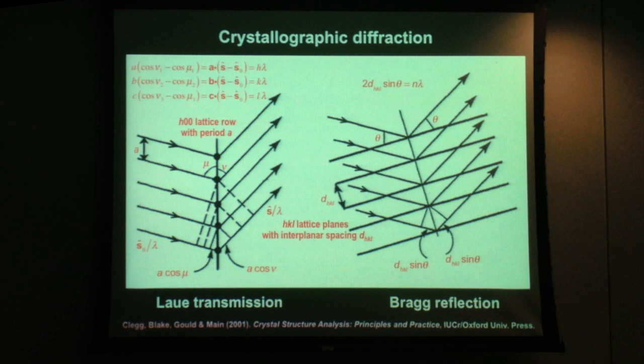We talked about the fact that Bragg realized that these very same X-ray diffraction effects could be interpreted as if they were specular reflections, mirror-like reflections, equal angles of incidence and scattering off the families of parallel lattice planes. And remember, clearly we are here talking about just lattice planes, not worried about any atomic or molecular structure in particular, just that there is a periodic arrangement of the atoms or ions or molecules.